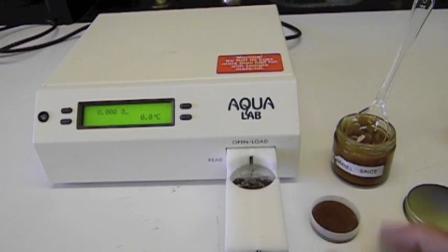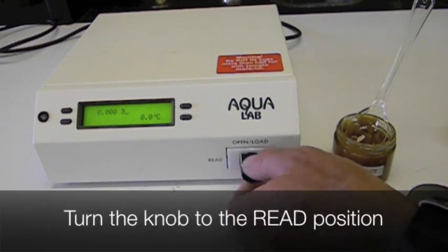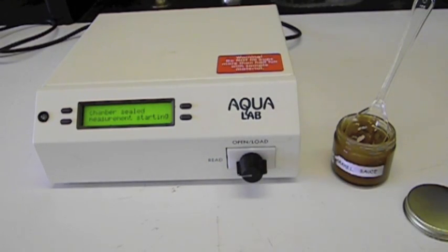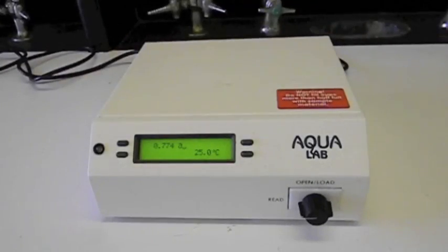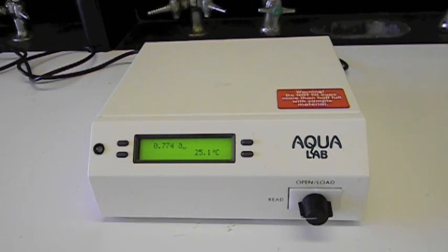Turn the knob to the open load position, pull the drawer open, and place the sample in the drawer. Turn the knob to the read position. When the reading is finished, the 0.774 water activity of the caramel sauce is displayed, followed by the LED flash and beeper.